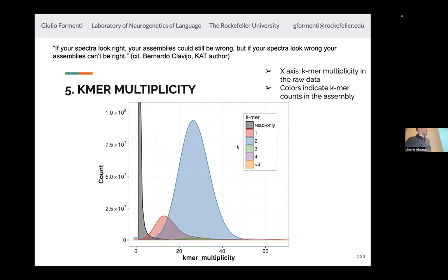So this is something that is 3 copies in the assembly, but if you look at its distribution, it's sort of peaking around 30, which is, again, as we said before, where the diploid stuff should occur. So here it says, well, there are 3 copies in the assembly, but the reads only really support 2 of them. So this is usually the sign of having some false duplications in the assembly. And that's the reason why there is this purging step that we're going to go over now.